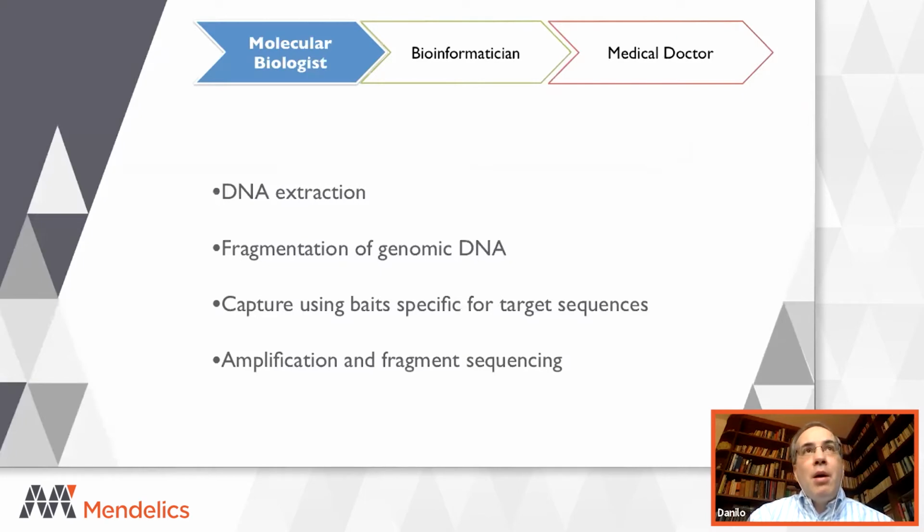The molecular biologists will begin with DNA extraction, then there will be a fragmentation of the genomic DNA. You have a big molecule, so you have to fragment this molecule into many pieces. These pieces will be captured by using baits specific for our targets, and then there will be amplification and fragment sequencing.